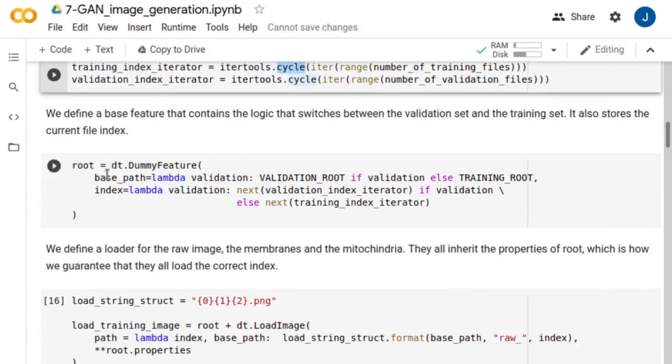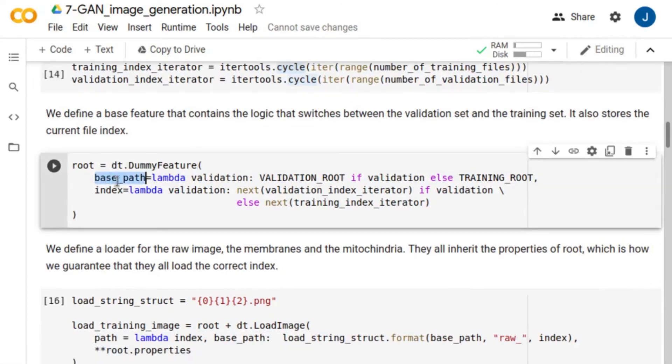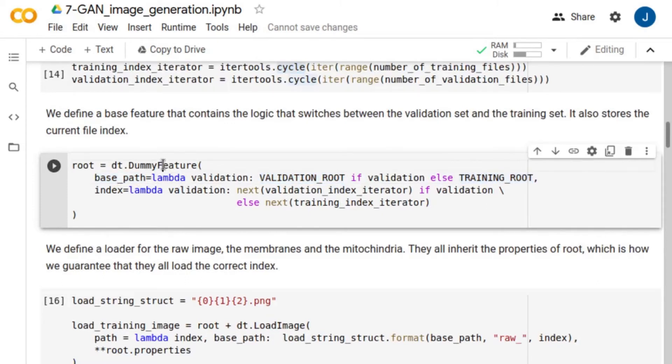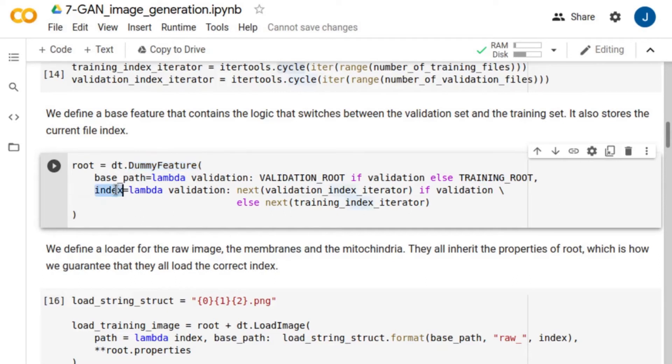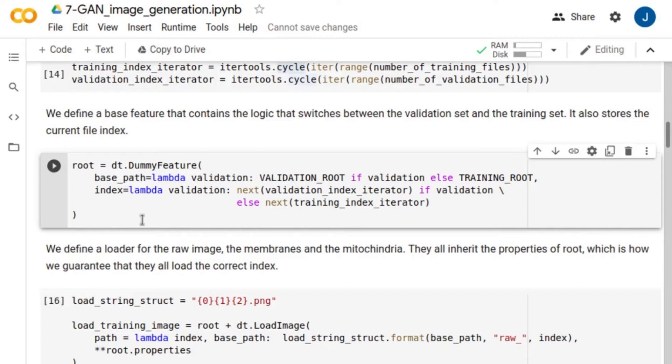Also note that the base path might vary depending on whether we are validating or training the network. To control all of this we define a dummy feature that contains the logic that switches between the validation set and the training set and stores the index file. This feature literally does nothing. It is only used as a container for properties.